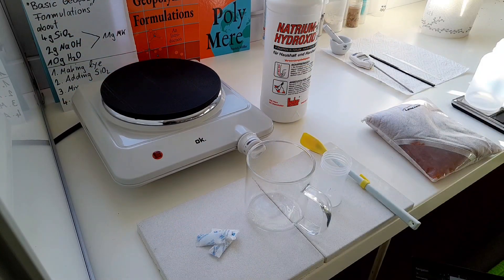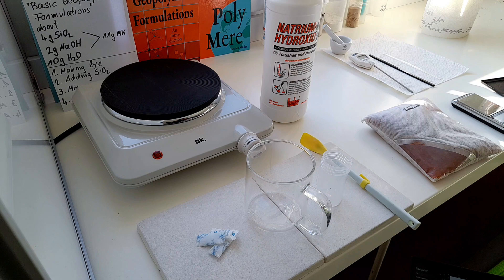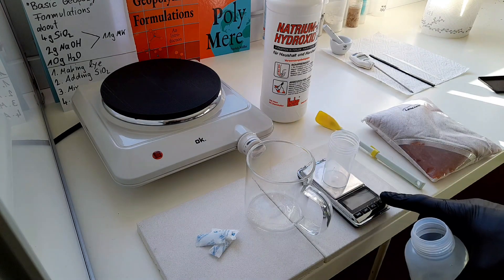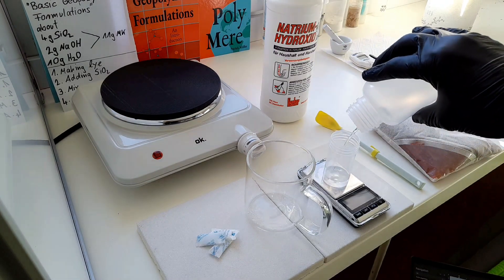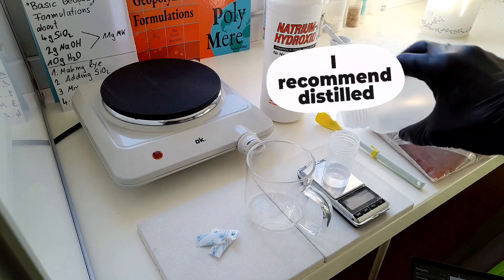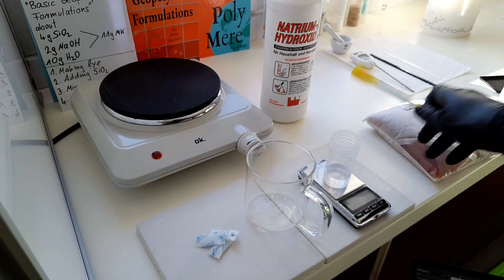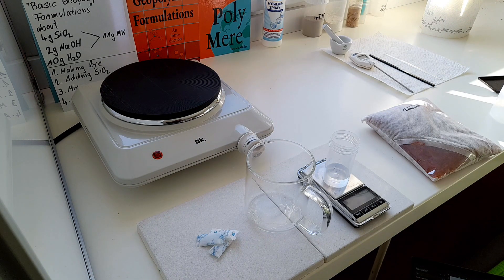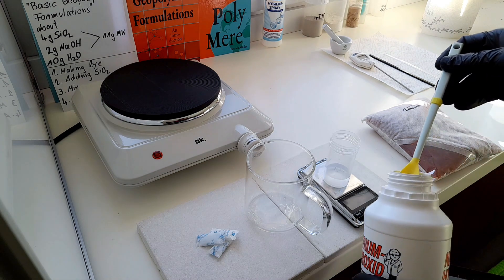Okay, first we make the lye solution, the sodium hydroxide solution, because it needs some time to rest. Next, we add 10 milliliters of water and then we add 2 grams of sodium hydroxide, which as you see is not much.